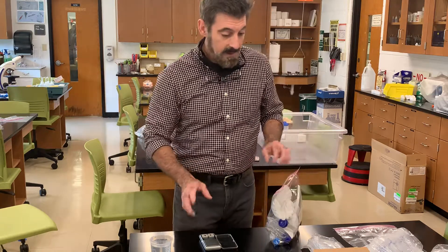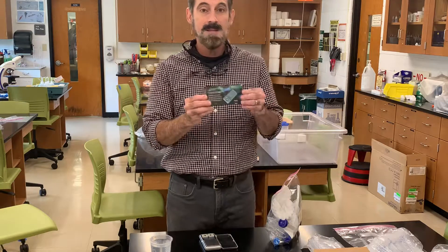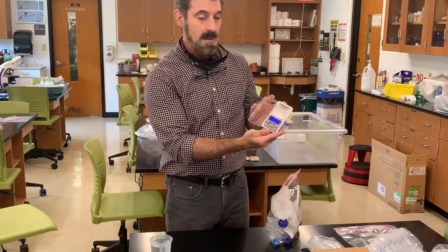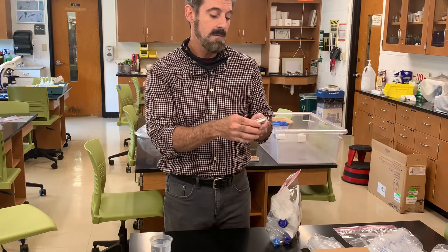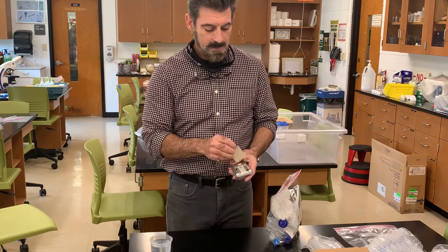In your kit, one of the things you're going to get is a pocket scale like this. You'll use this in several of the labs. This is a digital balance with an on/off button. The balances require batteries — they require two triple-A batteries to work.